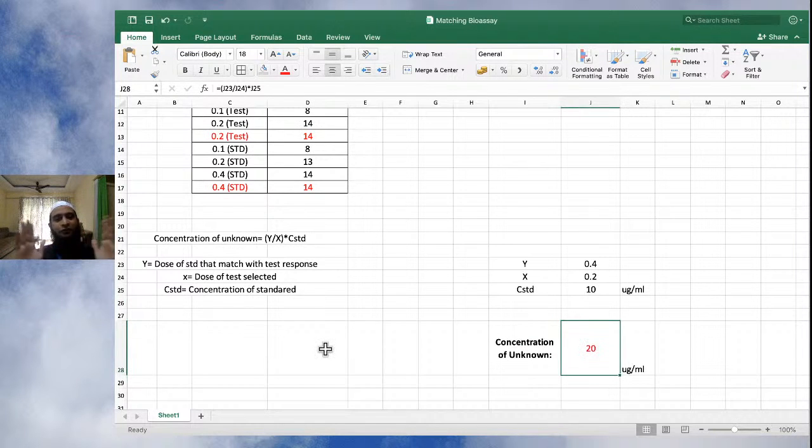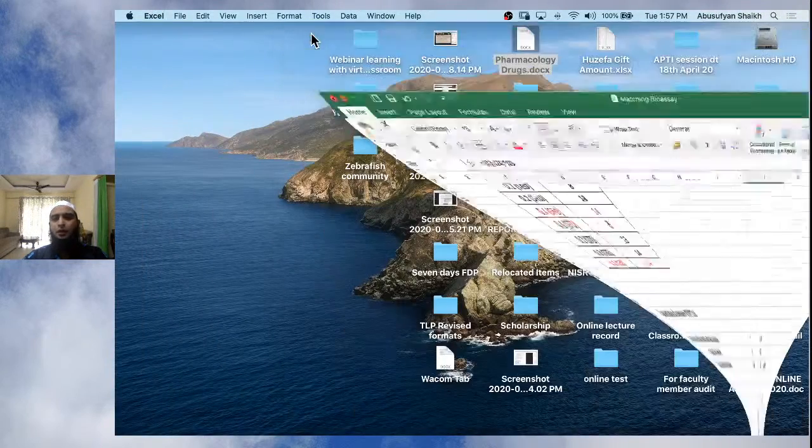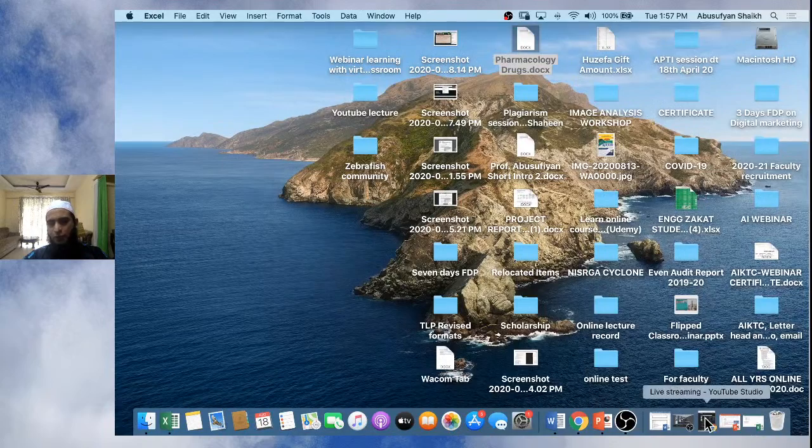There is no graph in today's experiment. You just need to calculate the unknown concentration and submit that in your e-journal. Okay, so this is all about today's experiment. I have done with my experiment. If you have any doubt, then let me know. I'm coming live here.